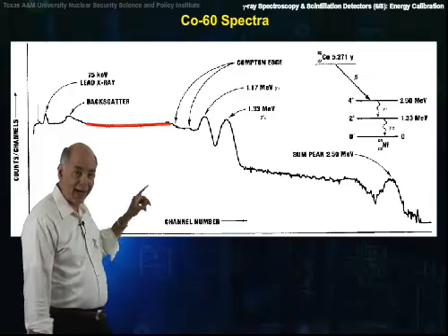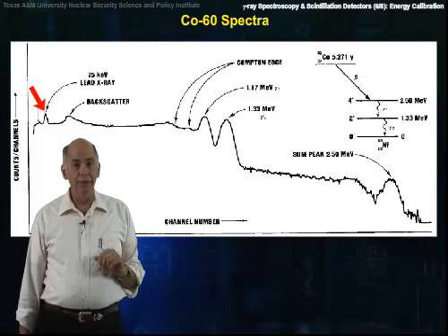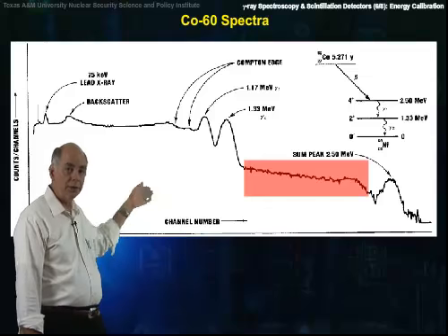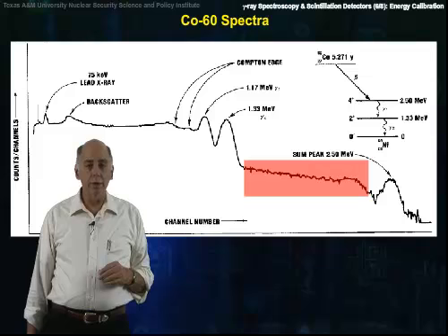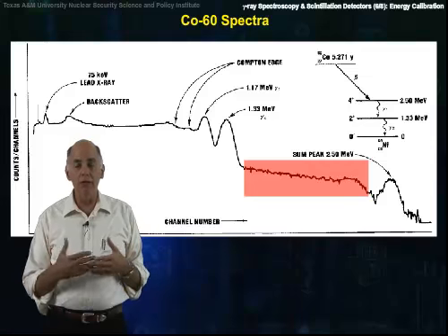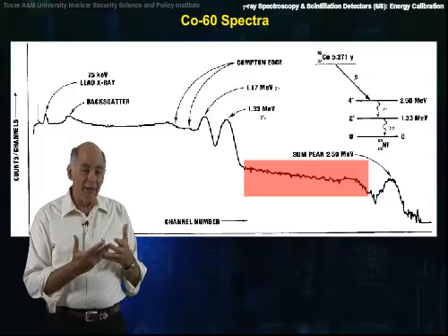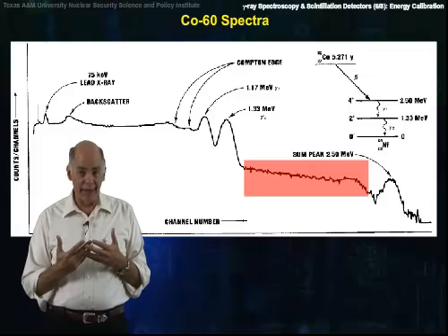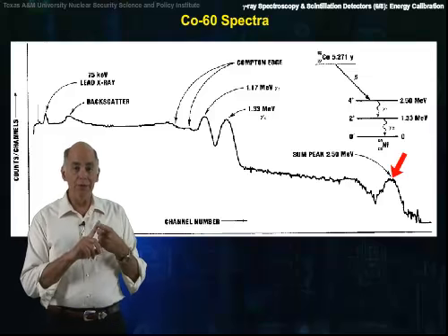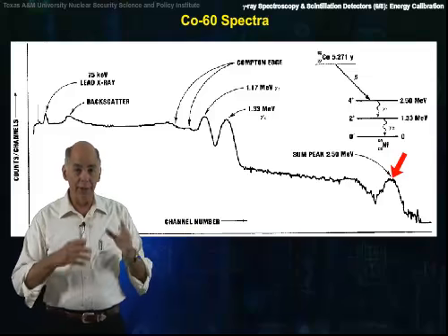Here we see the Compton continuum, we see a small backscatter peak, and we see a 75 keV lead X-ray. Above the photopeaks over here, we see a region with noise from either higher gamma rays or from summing of one of the principal gammas with a Compton interaction that happened within the resolving time of the detector. And we see a sum peak where 2 of these principal gamma rays have interacted in the scintillator within the resolution time of the electronics and just summed up.